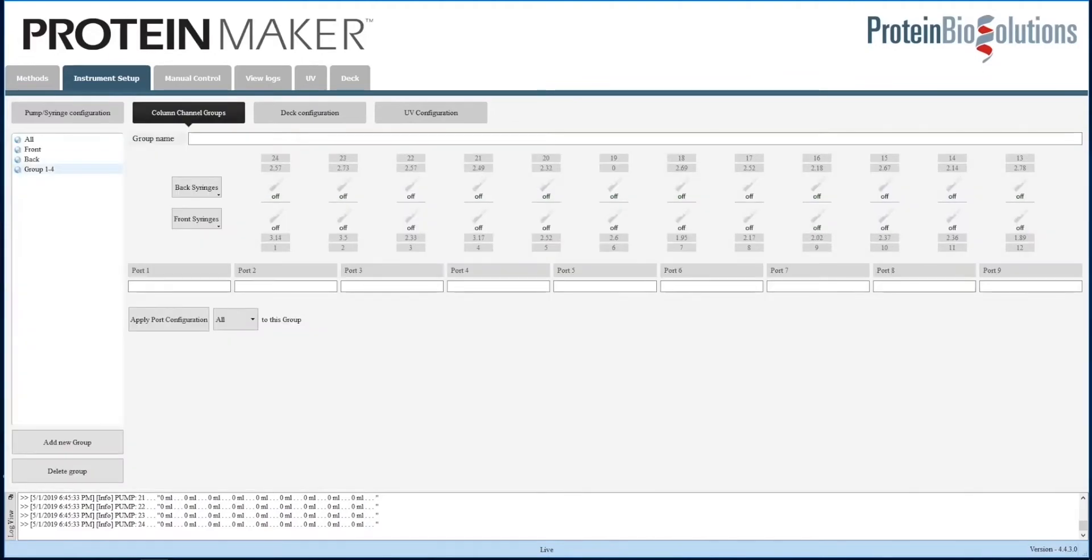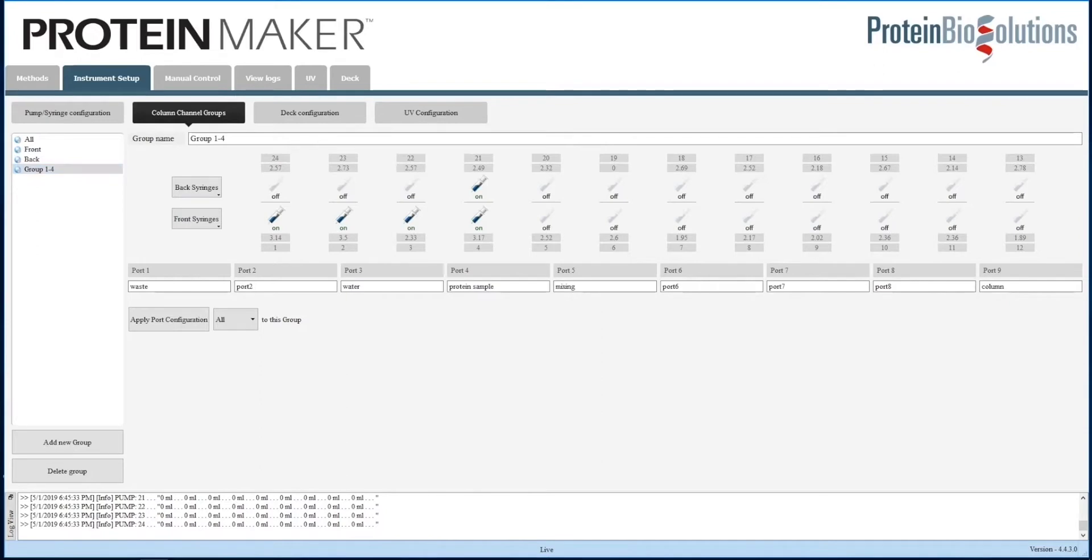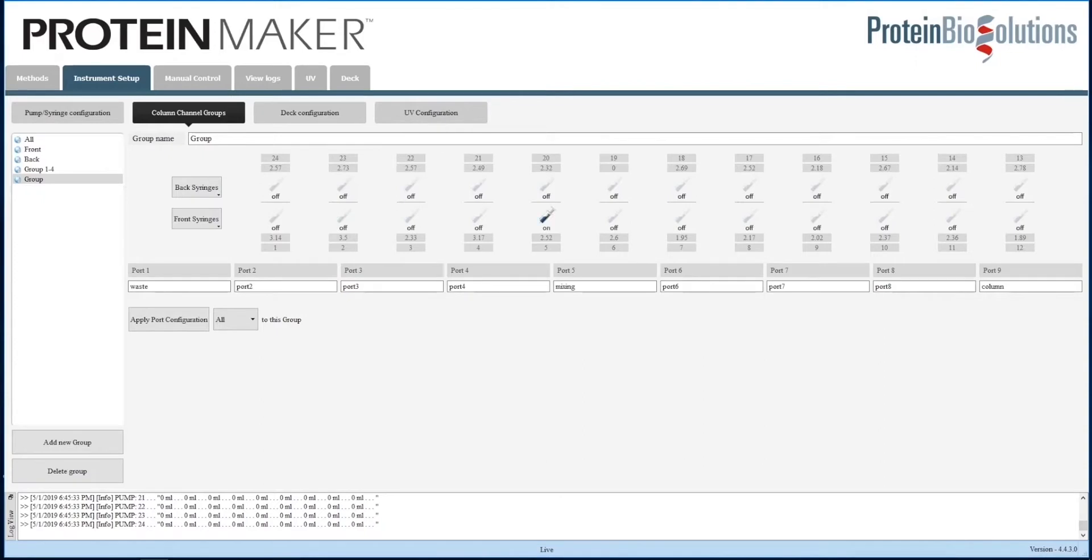I do want to show you the column channel groups. This is what we use to group certain of the 24 channels together. For example, this group contains channels 1, 2, 3, and 4. We can add other channels to this group, like 21, 22, or 23. We can take them away, name them as desired, etc. But this is the way that we enable communication to discrete groups of channels. This allows lots of flexibility.